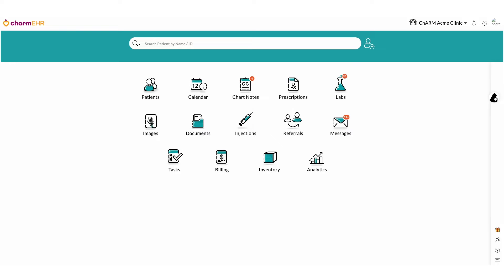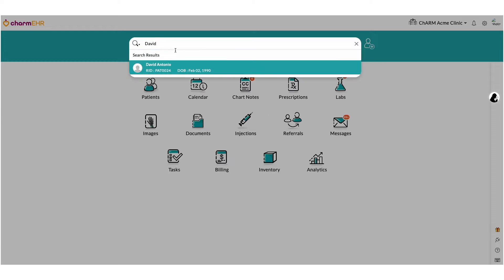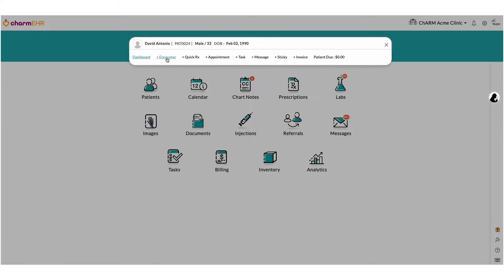Creating an encounter. In this section, we are going to create lab orders from a chart note on a patient's visit and then transmit them electronically to LabCorp. First, search for a patient and create an encounter.